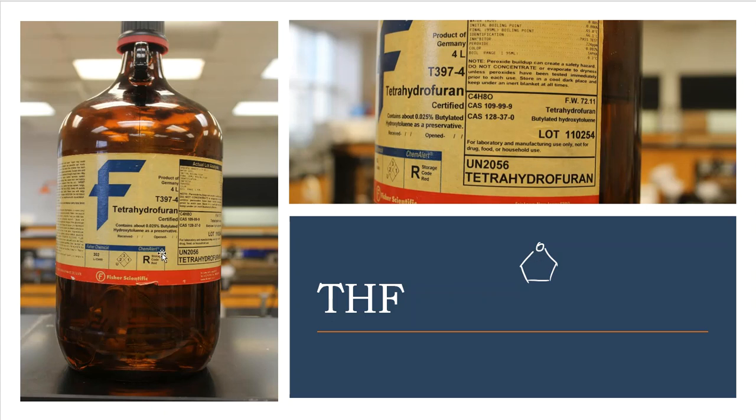So here's the bottle of THF. I first want you to notice the inside of this bottle. Do you see this thing here? That's a broken pipette. Somebody that used this before decided to break a pipette, and they just crammed the pipette down into the bottle. I don't know why. Don't ask me. Sometimes these things happen in a lab, and I have no clue why. But that's one of the things that I did find in the bottle.